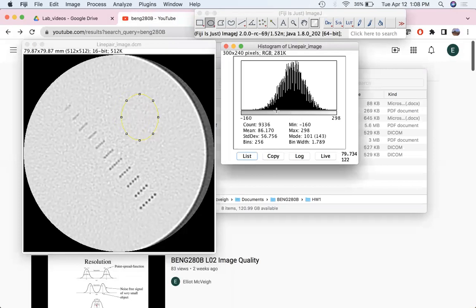It has a bin width, and it shows numbers of pixels in those bins. There are obviously too many bins, perhaps, for this histogram, so you get these blanks in here. If the bin width got a little broader, these blanks would go away. There is also a way to list these values in the bins.